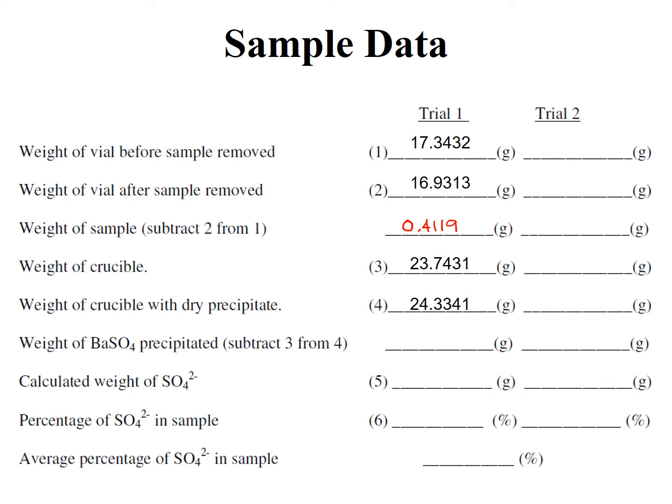This is much higher compared to this. All you need to do is this minus this one, which will give you around 0.591. The other step that we have here will be given in the next slide, sample calculation. For the value that we have here, you just get the average of these and these values here. You're given 2 trials in your lab report.